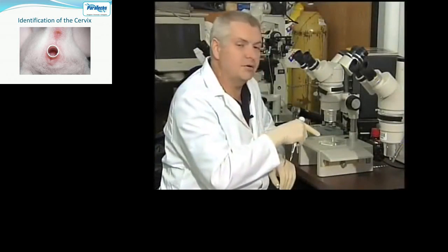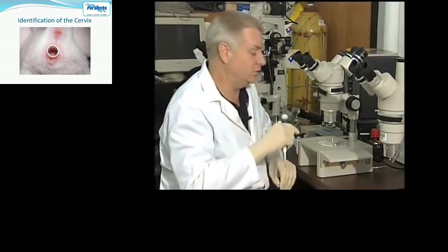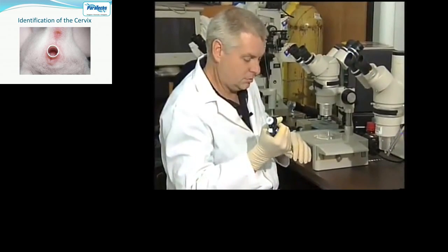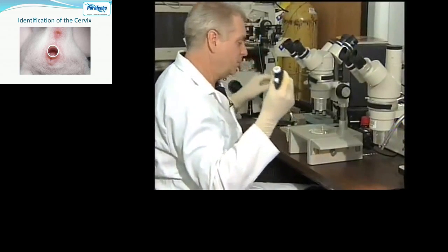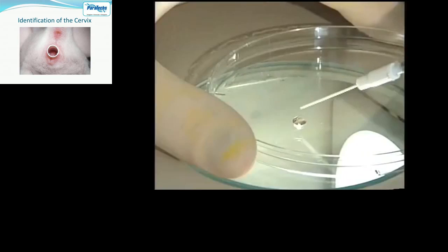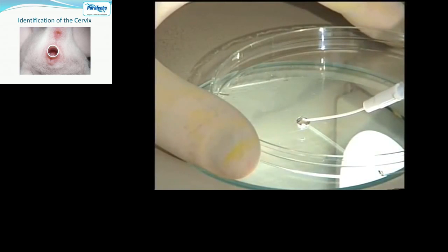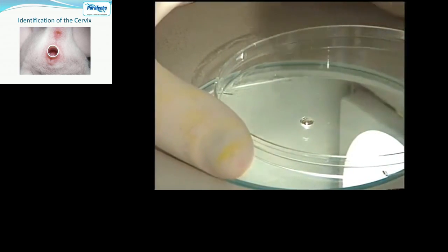I've placed a 15 microliter drop of media under the lid of this petri dish, and I've loaded my embryos into it. Now I'm taking the NSET device, and I've set my P2 pipettor to 1.8 microliters. You simply place the NSET device onto the pipettor, look into your microscope, bring the tip down, and slowly release the plunger to load the embryos.